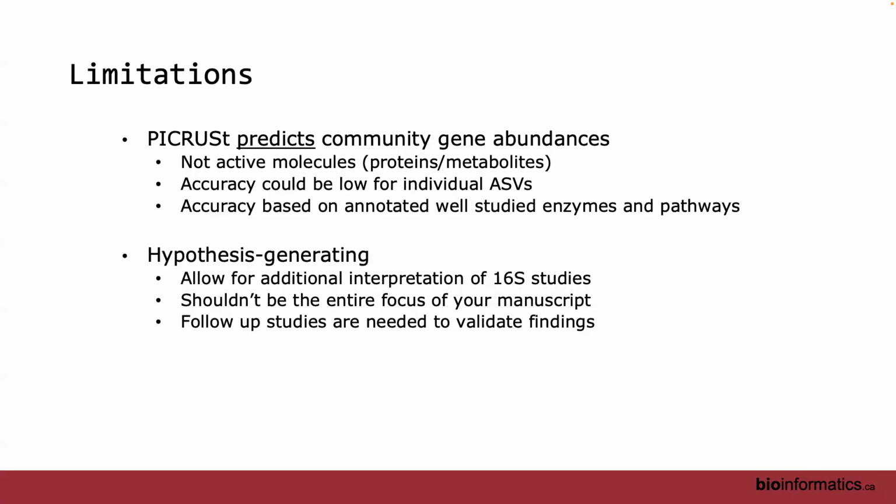So that's the limitations, and the biggest thing I always tell people is that it's a hypothesis-generating tool, right? You do your 16S study, and instead of just talking about the types of taxa that are different, it's an extra step to say, I wonder if there's something functionally jumping out from these types of bacteria that I'm not seeing just by their names. That's really why we developed the tool. From a practical standpoint, I wouldn't write a paper that's 100% based on PICRUSt results. It'll probably get shot down by somebody, but it often works as a nice, hey, this is one of the last figures in my paper, and these functions could be of interest.